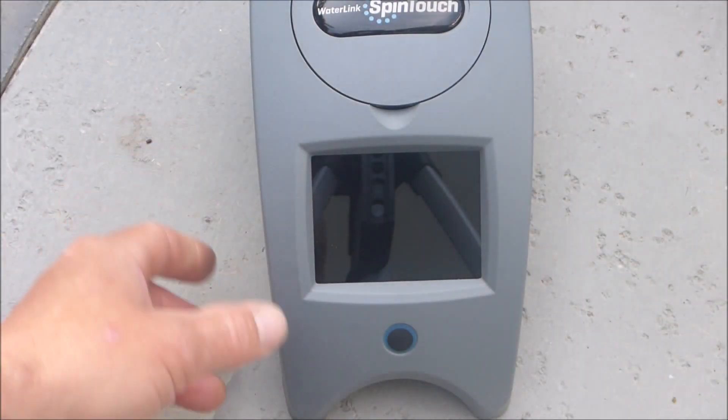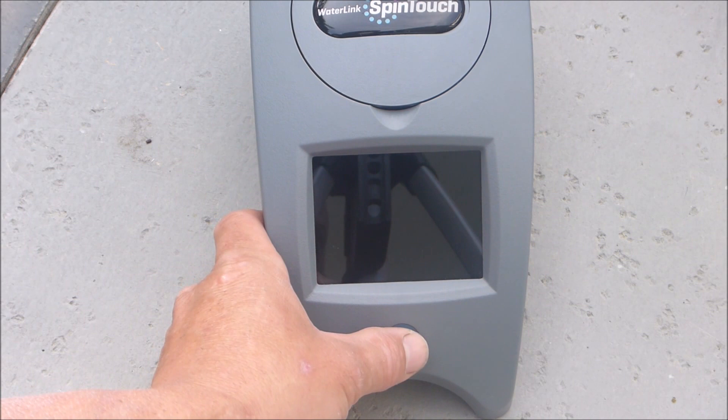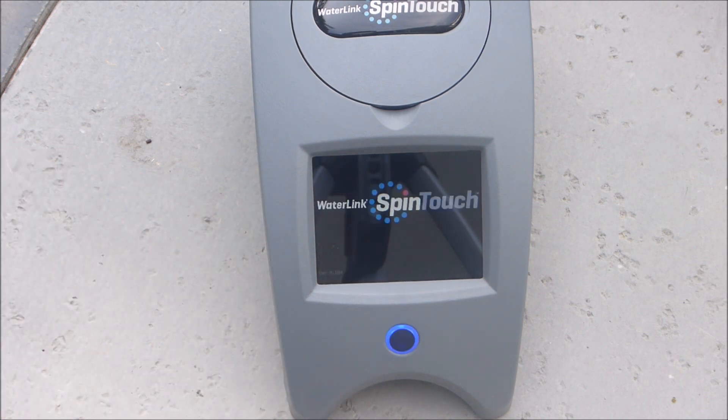When you first get the unit you want to initially charge it for 10 to 12 hours. This charge will last for about 150 tests.